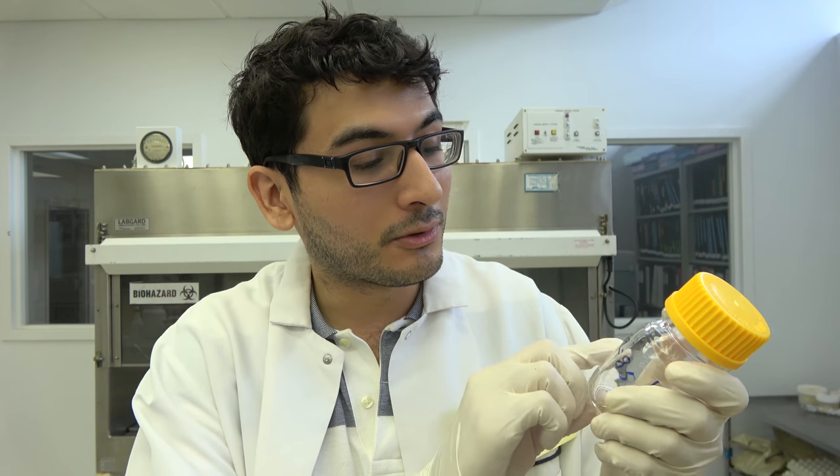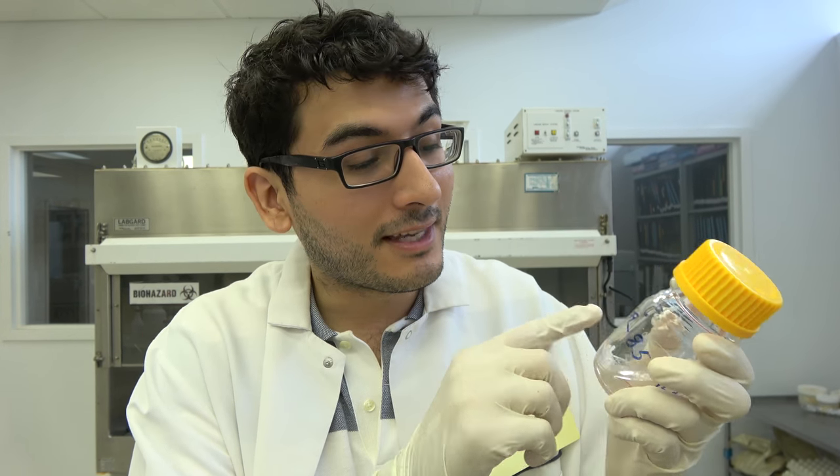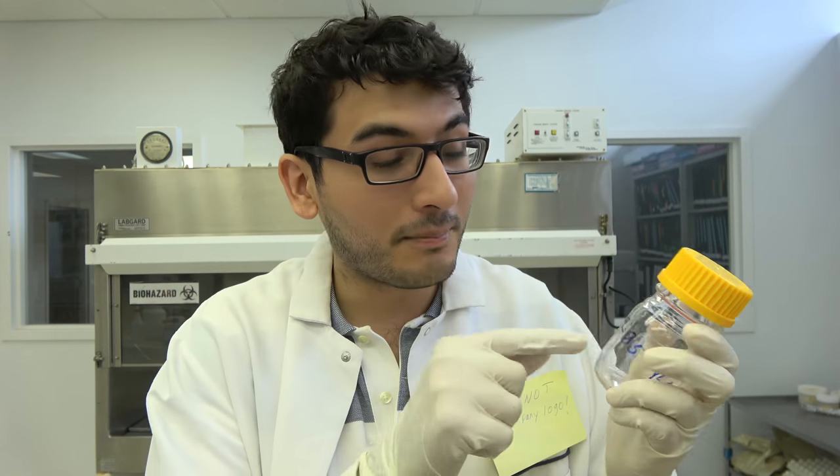Rule number two. Please, label the fuck out of everything. You can't believe how many times grown ass men in this lab do not label their shit. And it pisses me off. When I say label everything, I mean be as specific as possible. Don't just say alcohol. What's the concentration? What date did you put it in? My boss likes to do this thing where we label all our batches by notebook numbers. So, for example, 269-85.